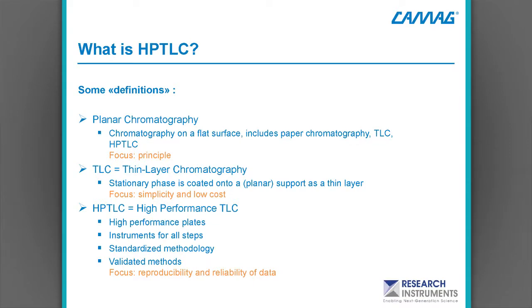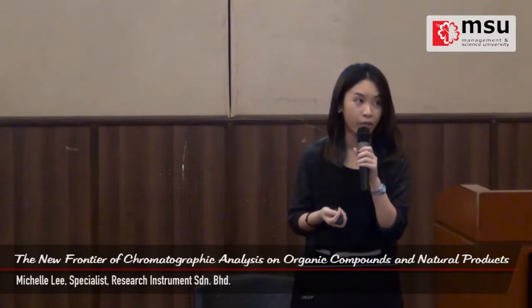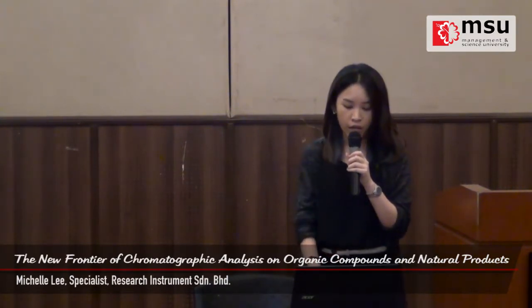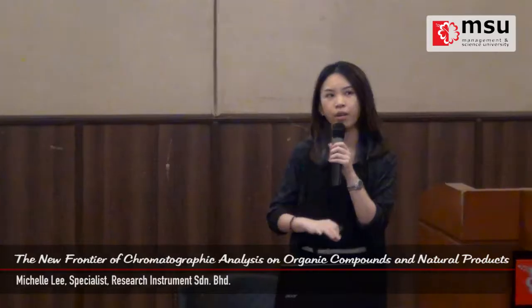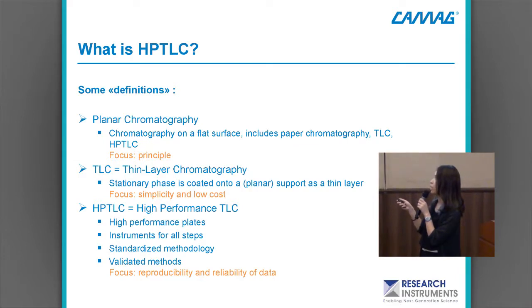Okay. So before I go into the deeper instrumentation, let me share with you some definitions regarding chromatography. First of all, what is HPTLC all about? What does it mean? Let's start with planar chromatography first, because chromatography is actually quite a huge group. There are various different chromatographies, and planar chromatography is about the stationary phase being in a planar form.